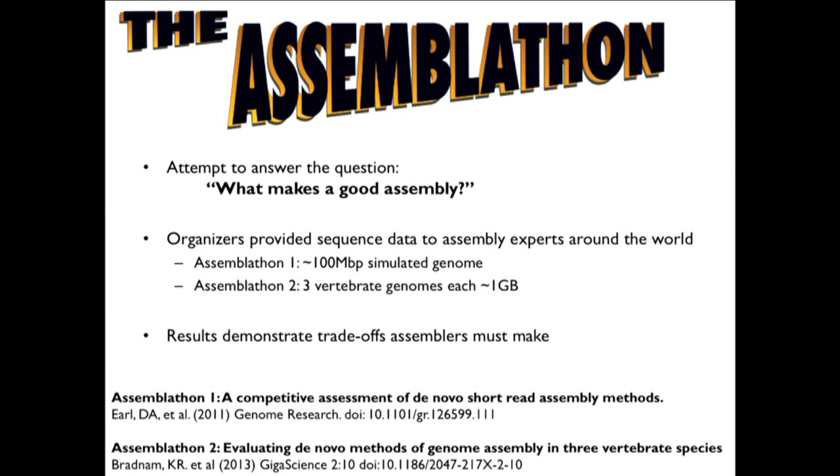Fortunately though, we don't have to go into this blind. There have been a few major studies that have been trying to benchmark all these assemblers and give you some guidance on what the best practices are. The first major project was in 2011, called the Assemblathon 1. There they took a genome that was about 100 megabase pairs. It was a simulated genome with simulated data, which has its own trade-offs. It was great in the sense that we could exactly measure how well the assemblers did, but of course, it's only as good as the simulation is.